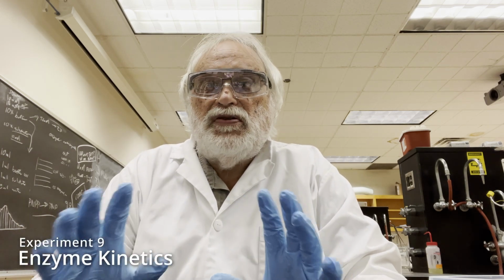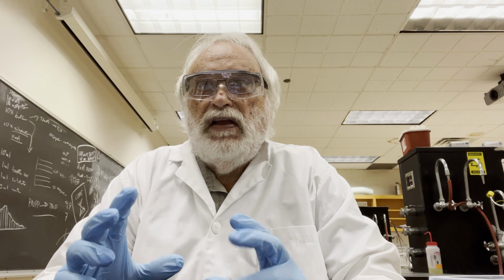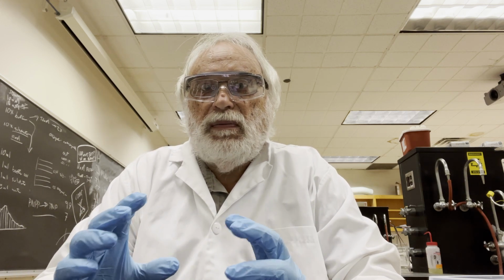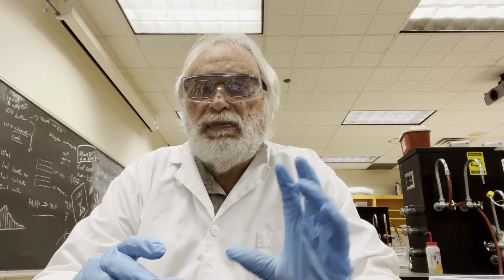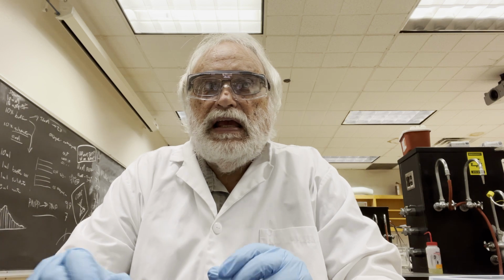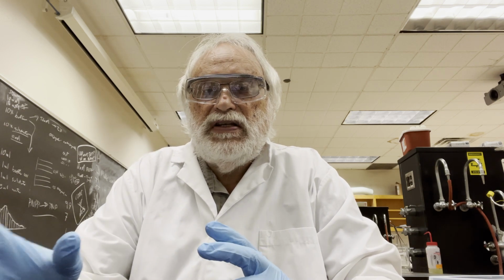Hello everyone. We've gotten to the point where, this semester so far, we created a vector that had an sgRNA sequence in it to allow us to make a mutation in yeast. Then we transformed using a repair template and that plasmid to create a mutant. And the following steps, we went ahead and grew up these cells.